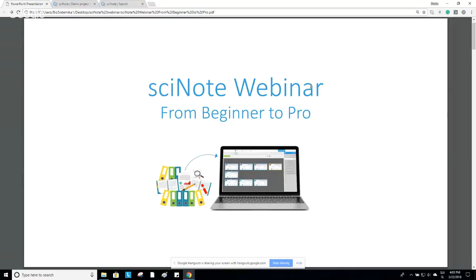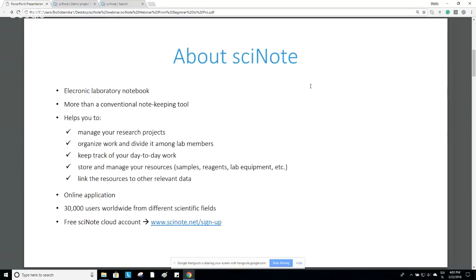Before we focus on the software, let me just say a few words about SciNote itself. So SciNote is an electronic lab notebook, but it's better to think of it as not a typical digital tool, because it offers so much more than, for example, OneNote. The logic we scientists use to enter research data is a bit different from how you would use a traditional paper notebook. This is because SciNote offers you that you can manage your research projects, you can organize your work and also divide this to your lab members.